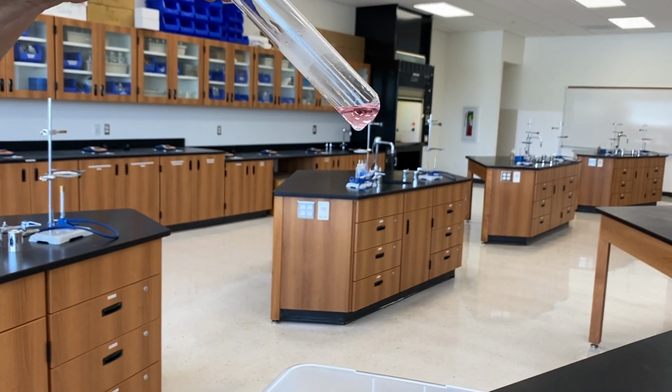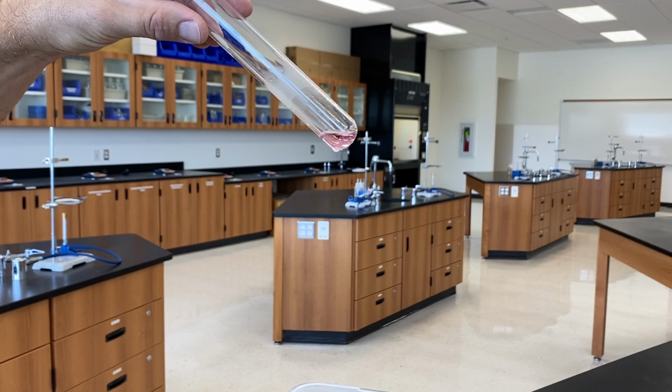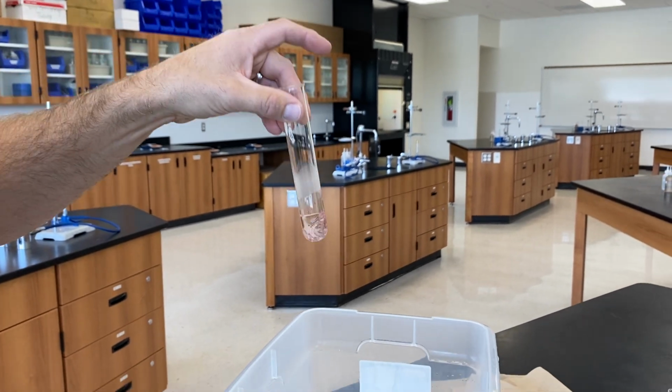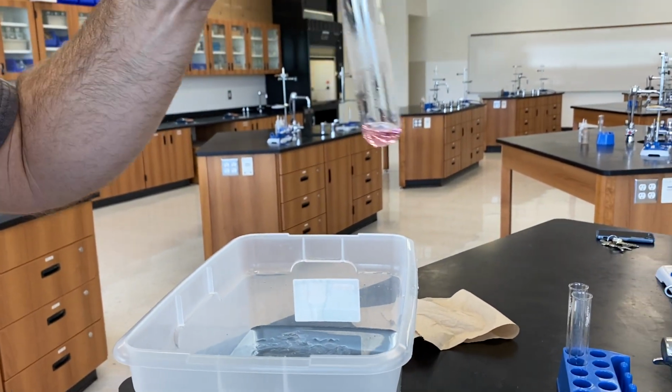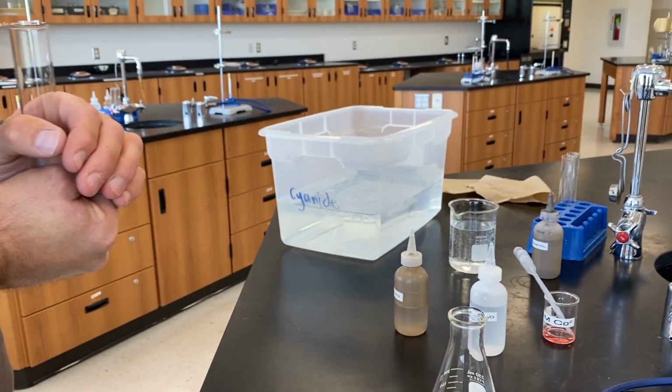And there we see that color change as we decreased temperature. Okay. Is that okay? Yep. Okay, so now we need to let that warm up. I'll put it in the palm of my hand to warm it up a little quicker.